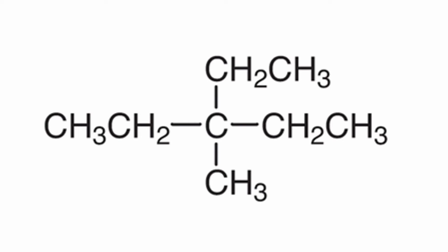How much energy it takes to flip that spin depends on how many things the carbon is bonded to. So when you look at a 13C NMR graph, you will get peaks at different points based on the carbon environment of the atoms. What do I mean by carbon environment? Well, if we look at this molecule here, this is a 3-methyl-3-ethyl pentane. We've got an ethyl and a methyl, both at the 3 position on a pentane.